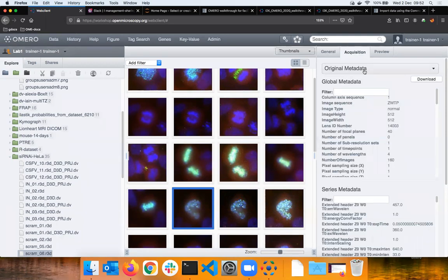And these metadata typically we don't encourage to change, but I will show you in a second how you can add additional metadata post-import, which of course you will want to do in, let's say, the client or otherwise, to post hoc annotate your images.